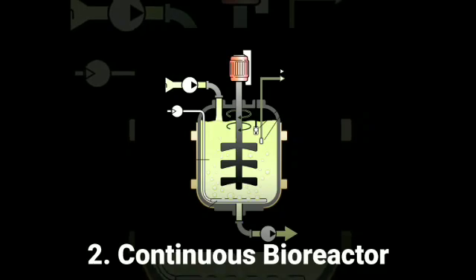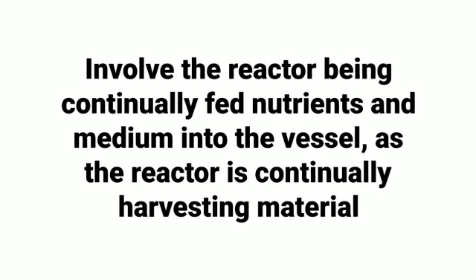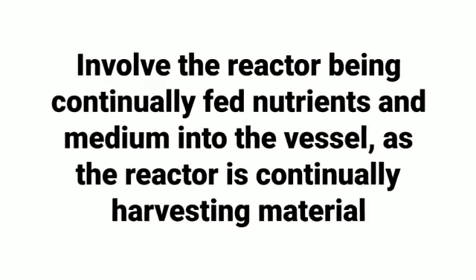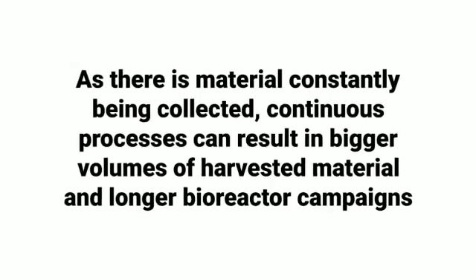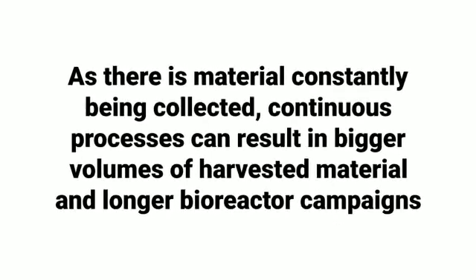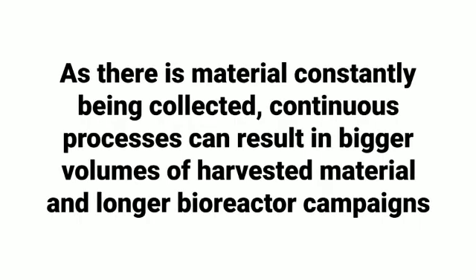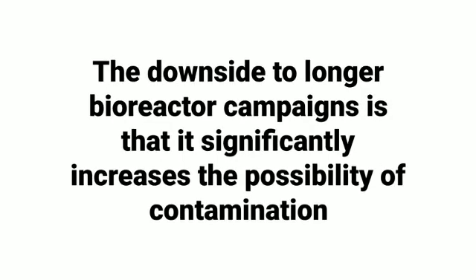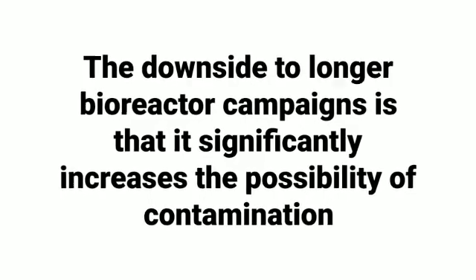Continuous bioreactor. It involves the reactor being continually fed nutrients and medium into the vessel as the reactor is continually harvesting the material. As there is material constantly being collected, continuous process can result in bigger volumes of harvested material and longer bioreactor campaigns. The downside to longer bioreactor campaigns is that it significantly increases the possibility of contamination.